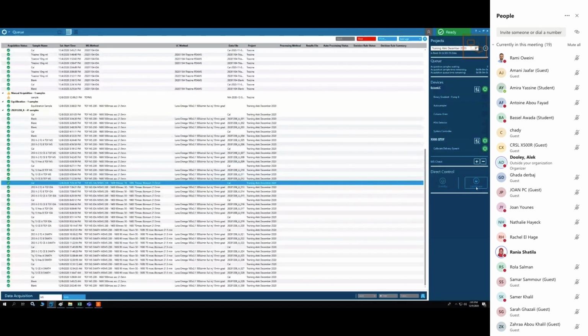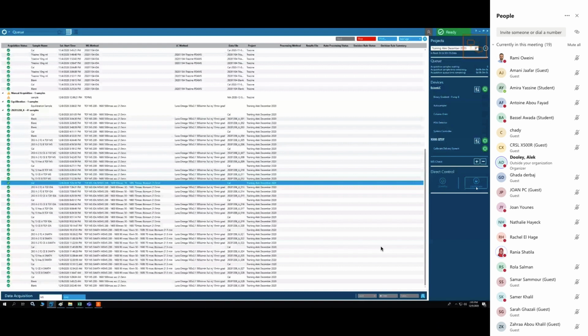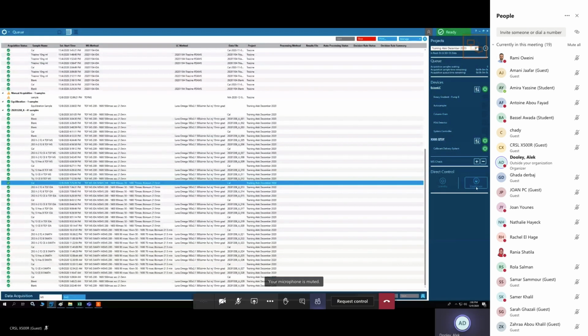Okay, sure. Right now, the instrument is powered. The electricity is on and the vacuum is there, but the instrument is not, quote unquote, doing something. It means that the ion source is cold, the HPLC pumps are not pumping, and the column oven is not at temperature. Those are all things that take a little bit of time to warm up. Especially anything to do with pumps and pressure and anything to do with heat will take a little bit of time to get ready and stabilize.